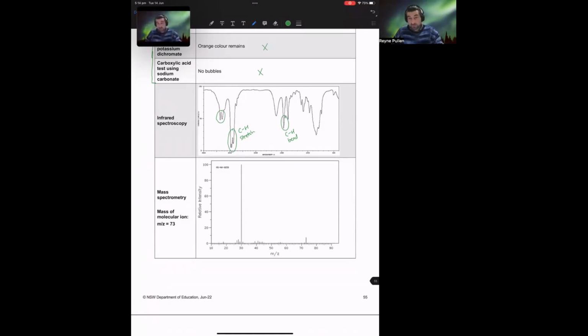That's not so broad. And this is where you would need to go back and consult your table that's in this document. And we need to start thinking, well, what other options are there where we see peaks at about that signal? And the one that we do see is going to be the nitrogen one. Okay, so a nitrogen to a hydrogen, we tend to see it about 3300 to 3500. And this is great to see. This then confirms for us our suspicions around there being something that was electronegative. It's got the protons that won't interact with our carbon proton environments. It's also got a bit of electronegativity, so it's going to de-shield some of our carbons.